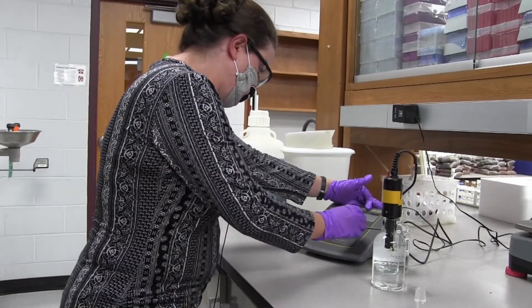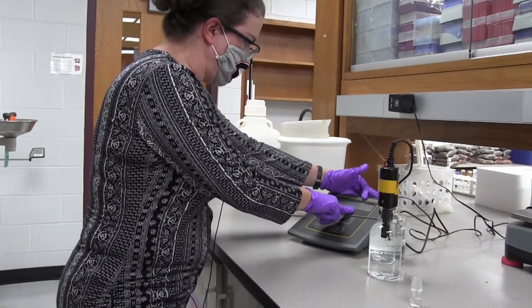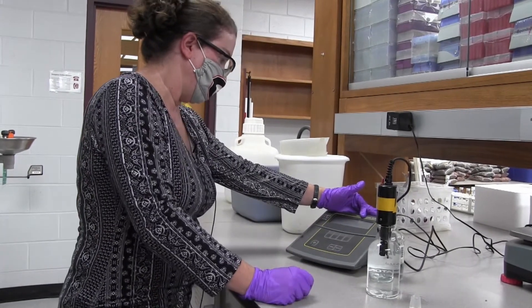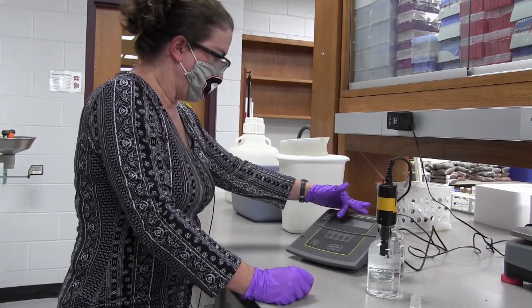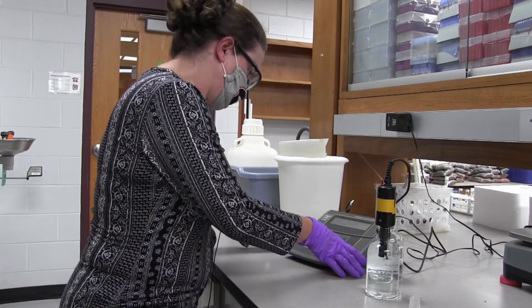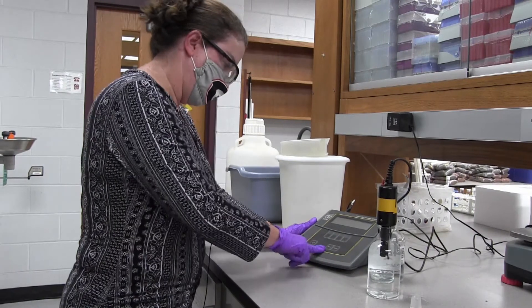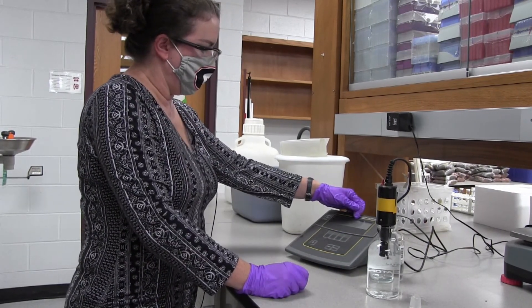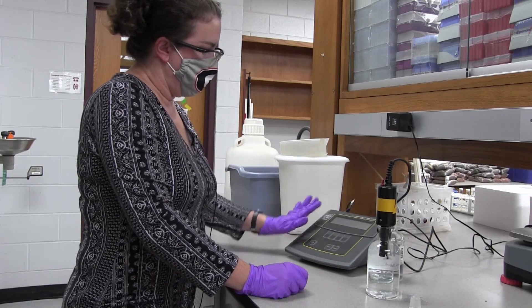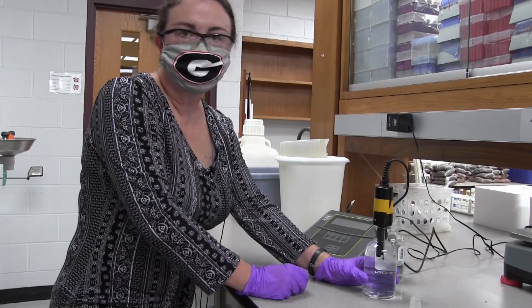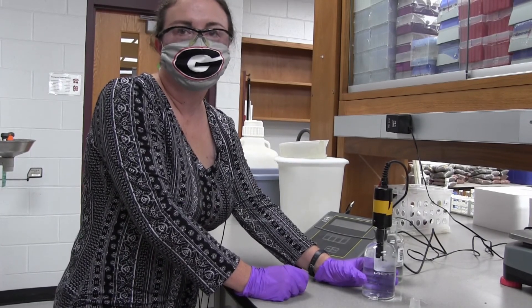Now it says press enter to save setting, so we're going to press the enter button. It says DO calibration saved. I'm going to press mode to get back to the main mode. Here's our 7.7. Now our meter is calibrated correctly to match the Winkler titration.